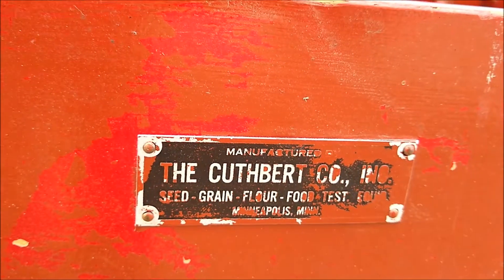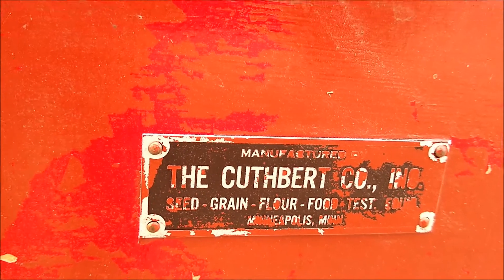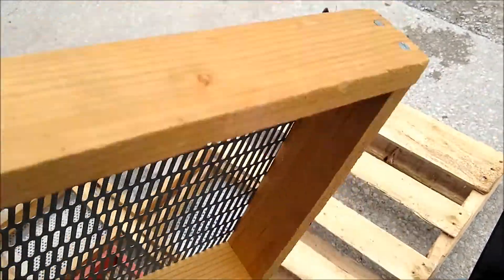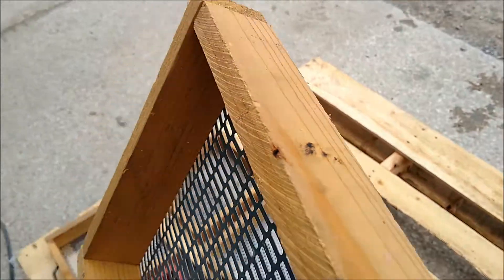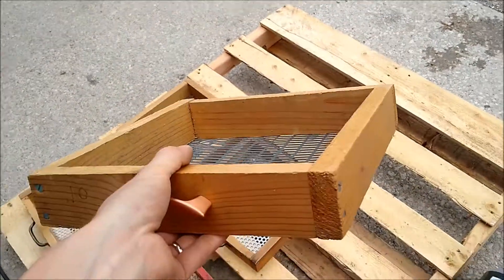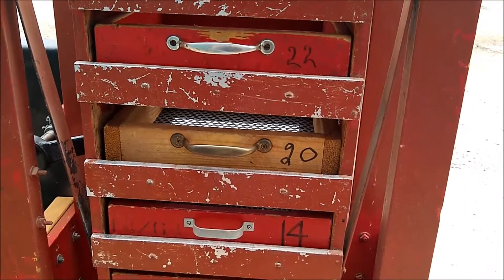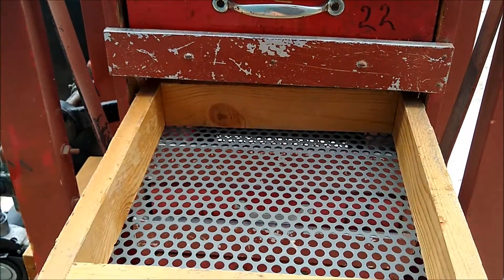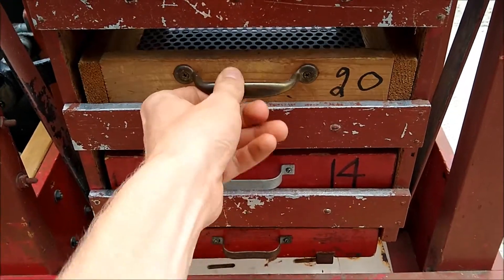Looking at the tag, you can see it was manufactured in Minneapolis, Minnesota. The screen frame is a very simple design, making it user-friendly. It has four different screen decks, and the screens are easily removed for changing them out — they slide in and out real nice.